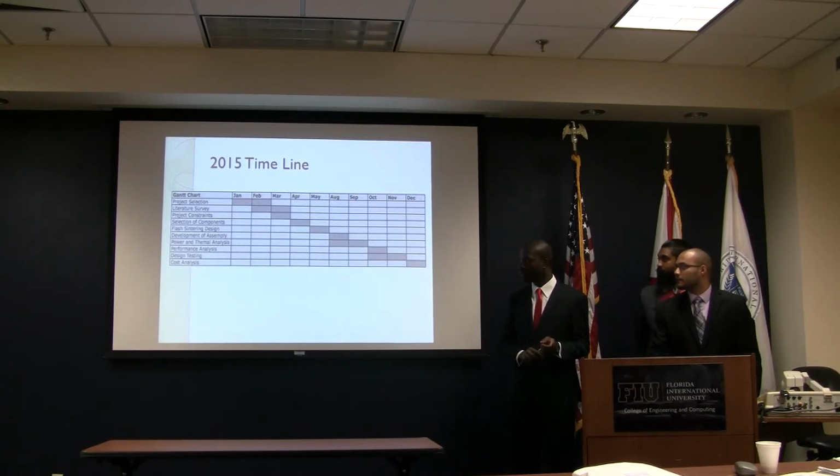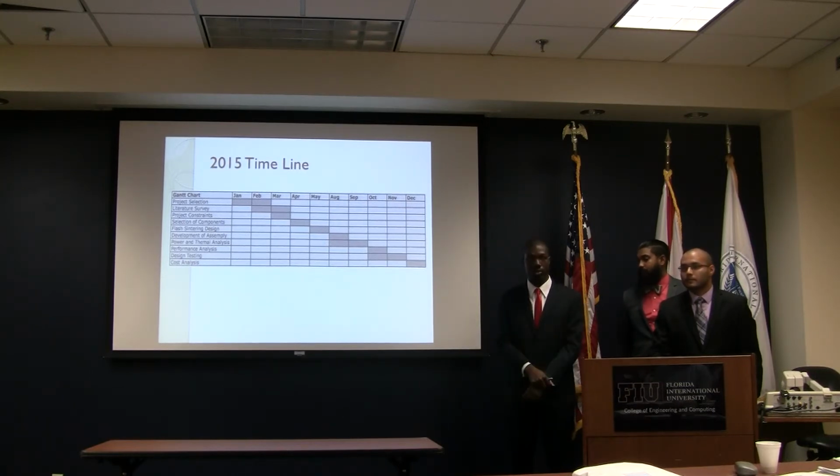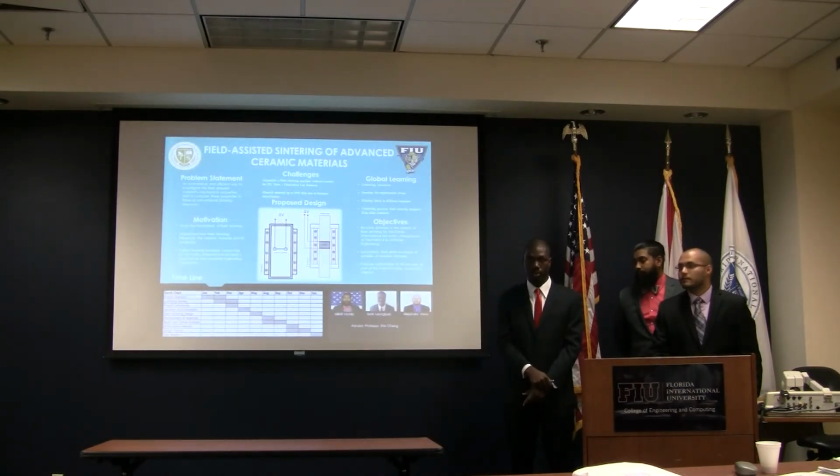So we will perform tests on the die because we are designing it ourselves. We have to make sure it will withstand 12 megapascals of pressure, because that's what we've seen to press the powder in other literature survey. And thank you. This is our presentation.